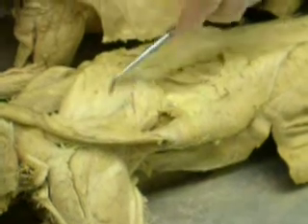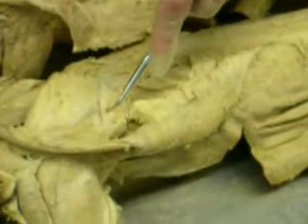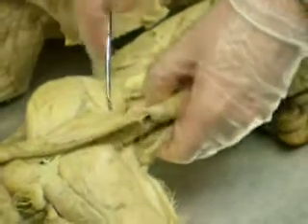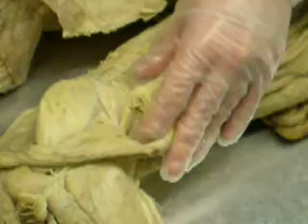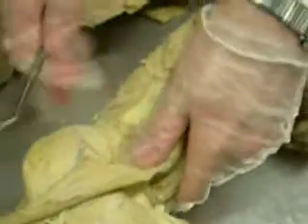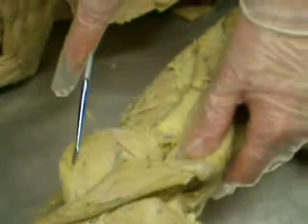So the muscle above — supra means superior. Supraspinatus. Infraspinatus is below the spine of the scapula. And then teres major — it's the little thing below the infraspinatus, it's the bottom. This is the teres major, the bottom border. But we don't need to know teres minor — cross off teres minor.